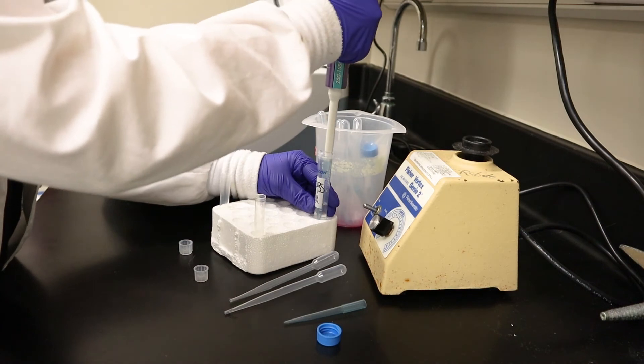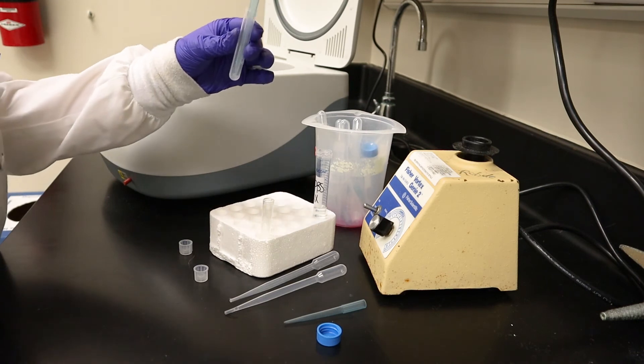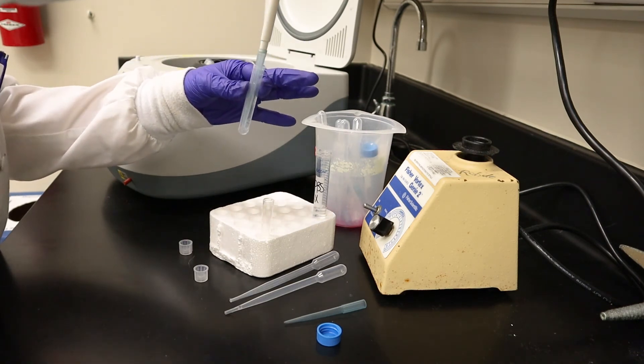Once the tube was empty with only the pellet present, I added half a milliliter of PBS. I triturated my cells within the PBS to resuspend them and spun them down for 5 minutes into a pellet.